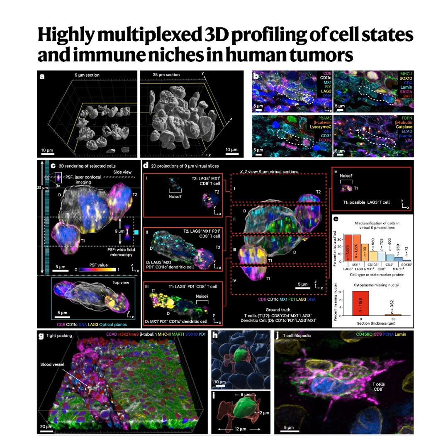Well, take the immune cells, which are critical in cancer. They saw CD8 plus T cells. These are the main killer cells of the immune system, extending multiple filopodia, sometimes longer than 5 or even 10 micrometers, out from their main cell body, probing their environment.